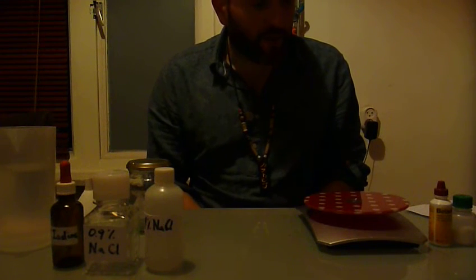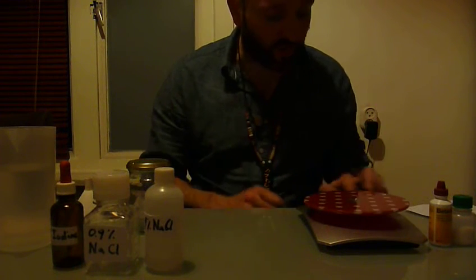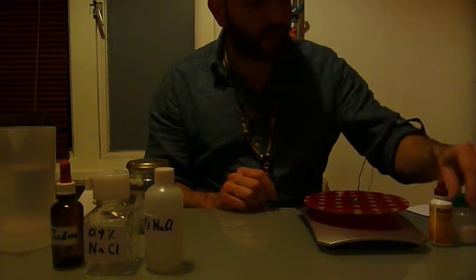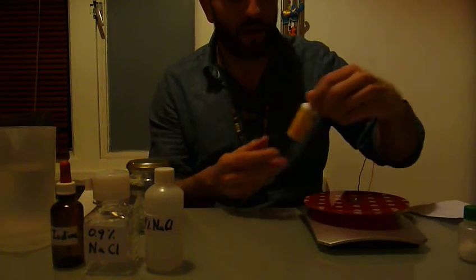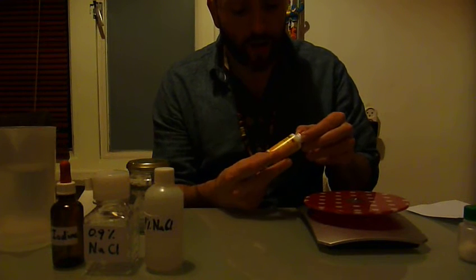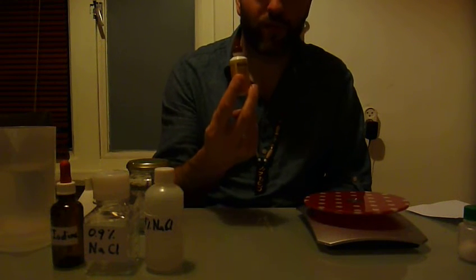As I guess you don't have a very accurate scale, I'm going to demonstrate it with a normal kitchen scale — a sensitive one — it should be able to measure units of 1 gram at least. We need some normal salt, sodium chloride, and I got here some regular betadine, some iodine solution that you use for disinfecting wounds. Check the concentration on the bottle — this one is 100 milligrams per milliliter, that's a 10% solution.